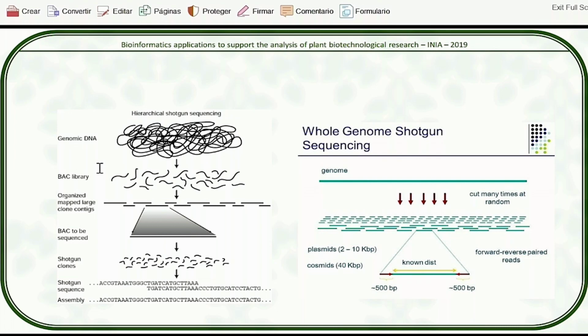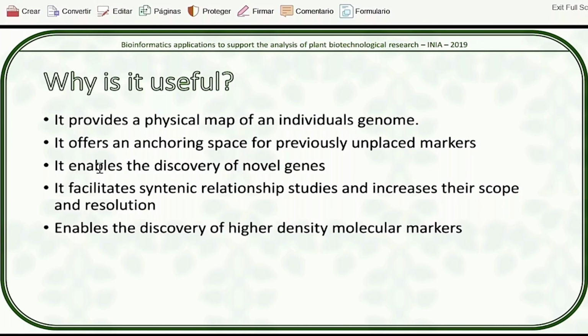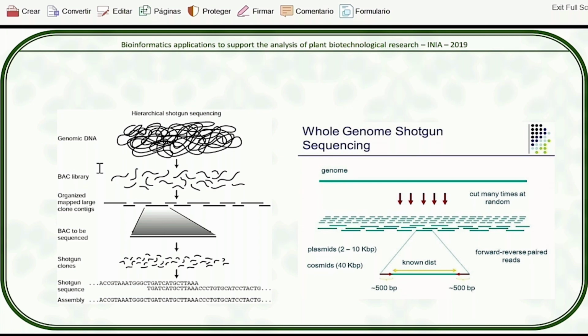And that's where the first approach to tackle this kind of massively parallel sequencing came to be, the De Bruijn graph. We're going to talk about it later on. This new sequencing technology required a new algorithm for tackling the assembly problem. We couldn't rely on hierarchical sequencing anymore, because we weren't using the same technology. We're using new technology that had different characteristics, that made it impossible to know or guess beforehand which sequence was contiguous to the next one.